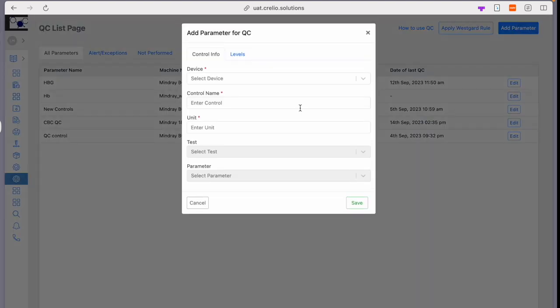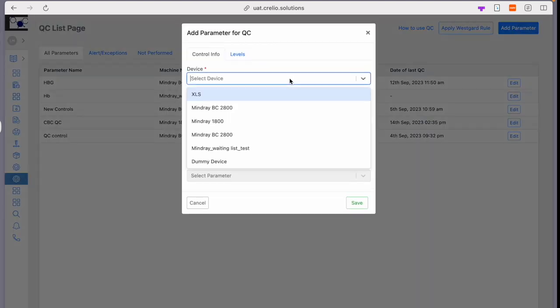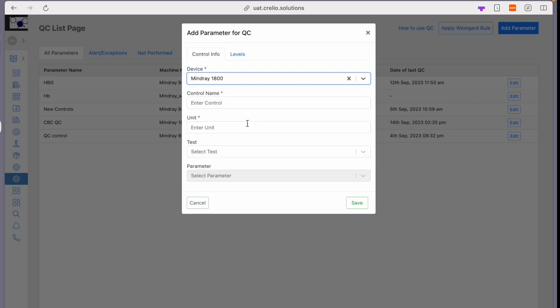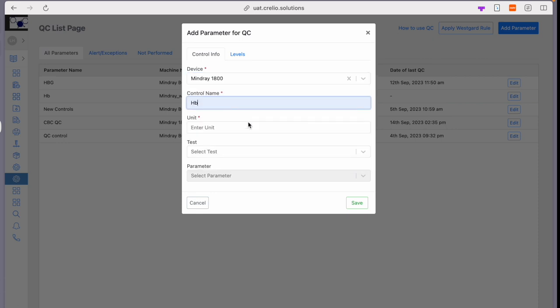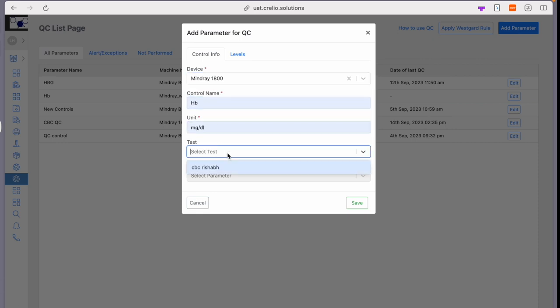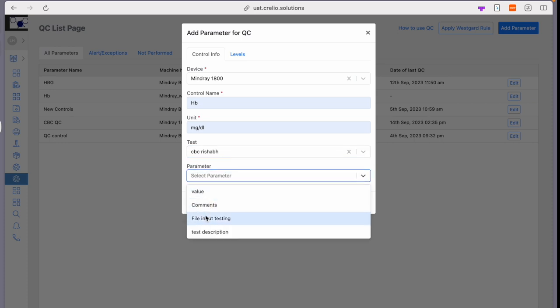you can click on this button, select the device, enter the control name, the unit, and the test for which you want to map the control for.